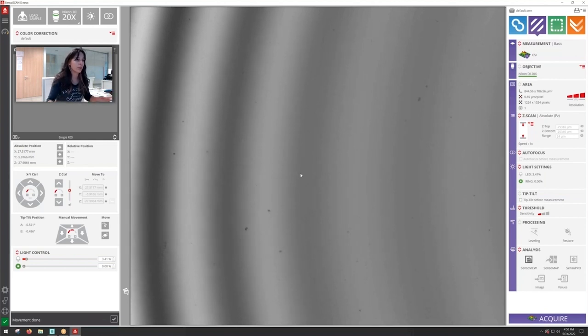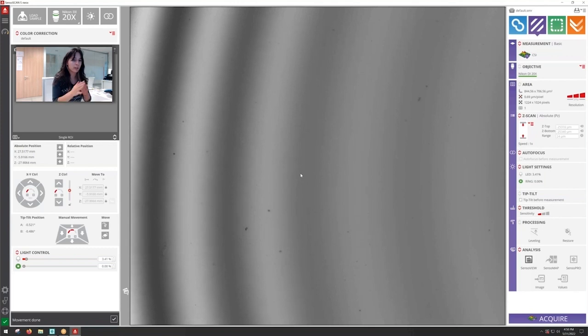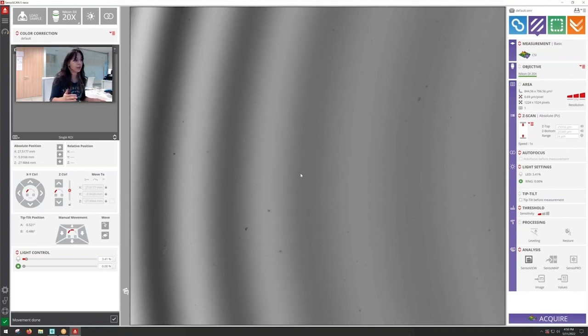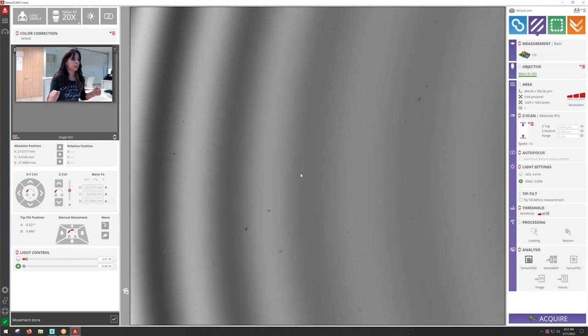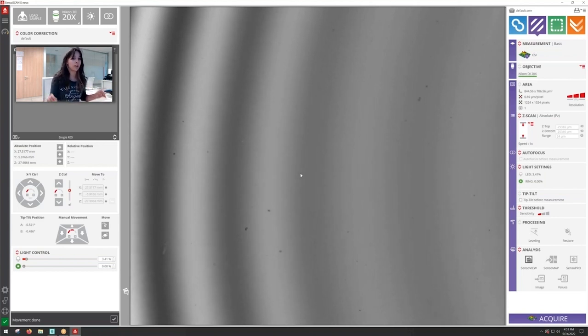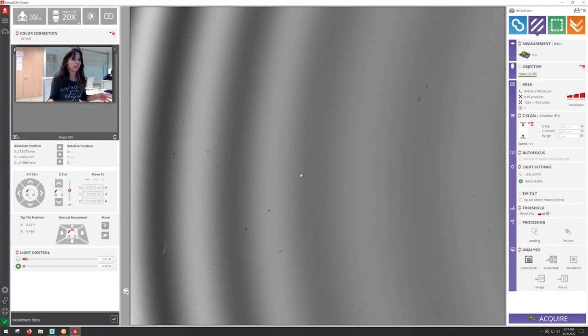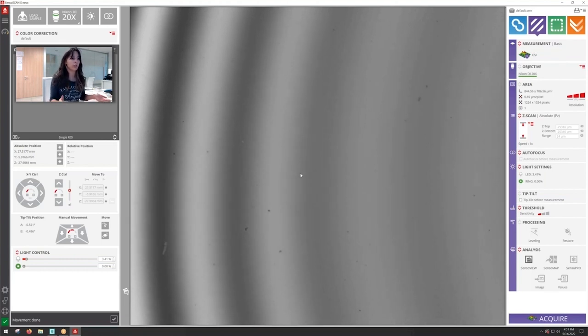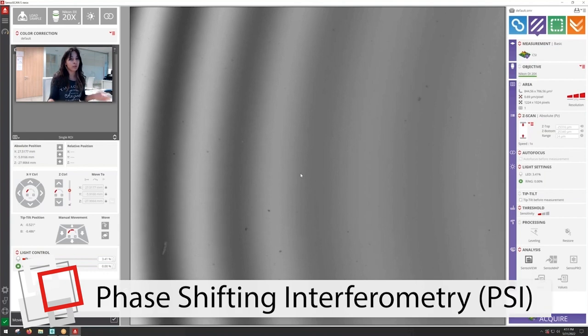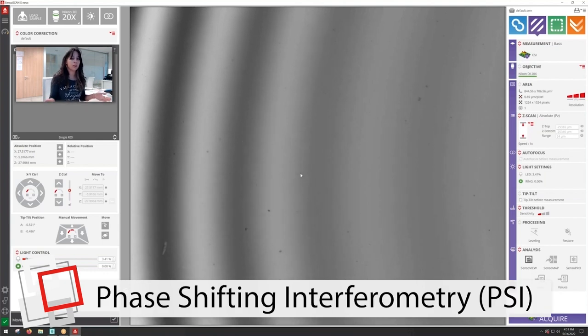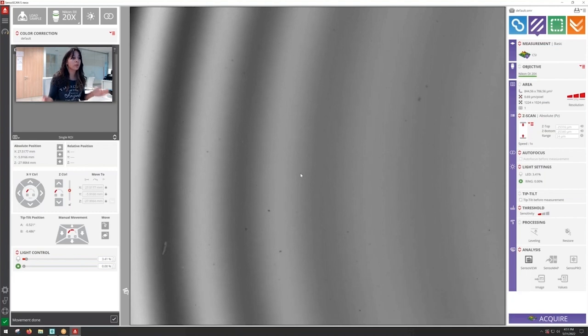We're going to start with an extremely smooth surface which is part of a wafer and actually is the part of the wafer that doesn't have any structures on. So what we need to actually use for this kind of sample is the technology, the mode of interferometry that is going to have the best vertical resolution, which is phase shifting interferometry that has a vertical resolution down to 0.01 nanometers.